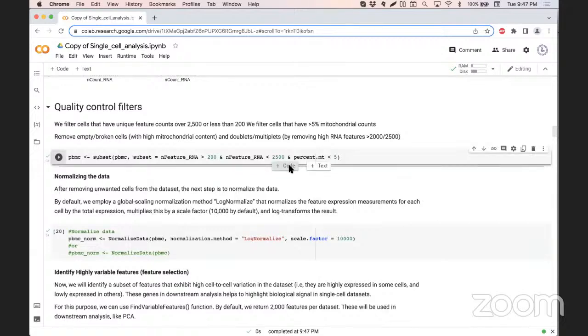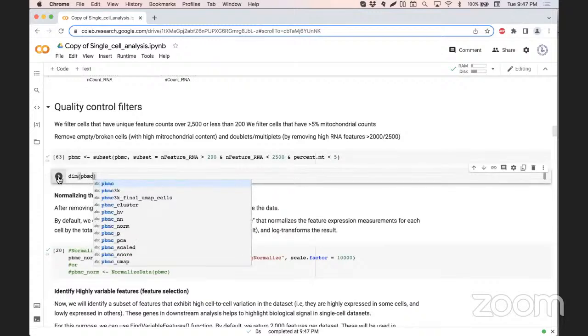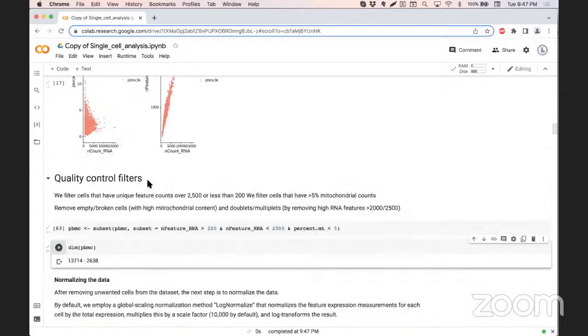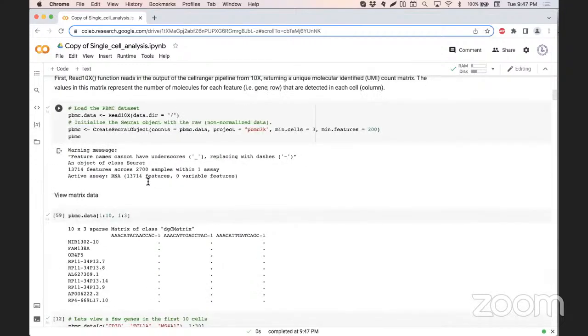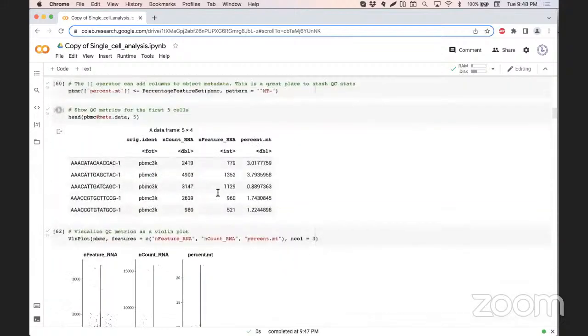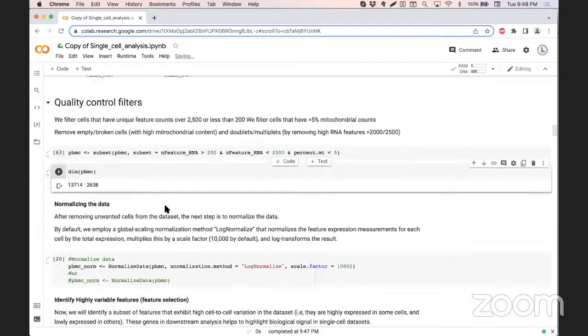This is where we are rewriting our data set by subsetting it. Let's see if I check the dimension, how much have we reduced. We have not reduced a lot. From 2700 samples, we have filtered out something around 78 samples.